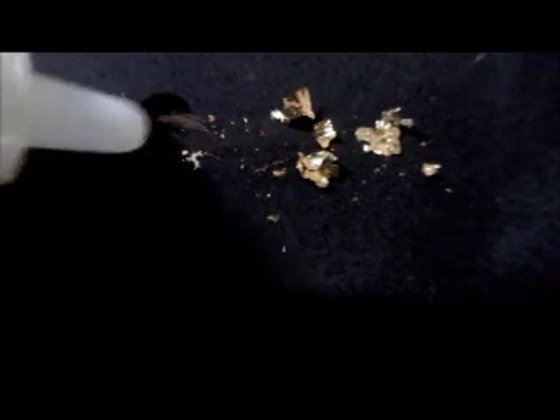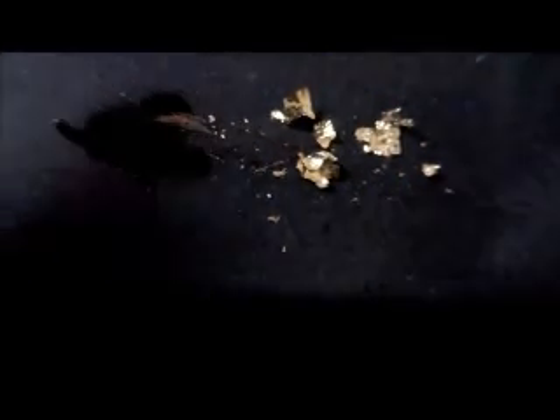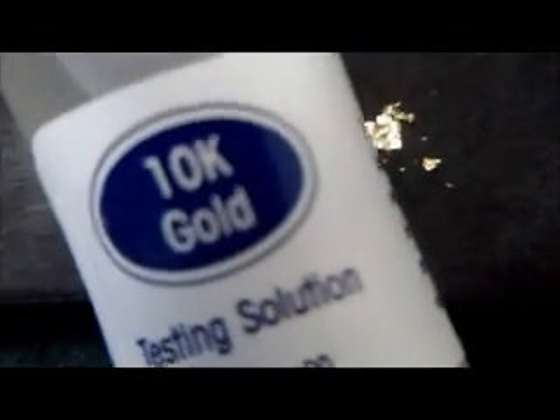This is the 14 karat. So the 14 karat gold is hardly affected at all — the real one. I use my plastic pen point here to kind of move the gold into the acid. Look, it disappeared — it was eaten right up. And then the 14k sample is not being eaten. So now we'll try the 10 karat — maybe it's less gold than 14k.